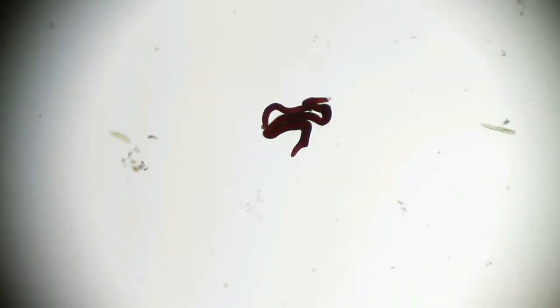Actually, thinking about it, it looks like bloodworm. We used to sell that as a live food in my family's aquarium shop. It's food that you give to fish. Could be that. I've never seen bloodworm under a microscope before. They're so very red, and I don't know anything else that I'm aware of that would be that colour. So I think the most likely thing is bloodworm for this one.